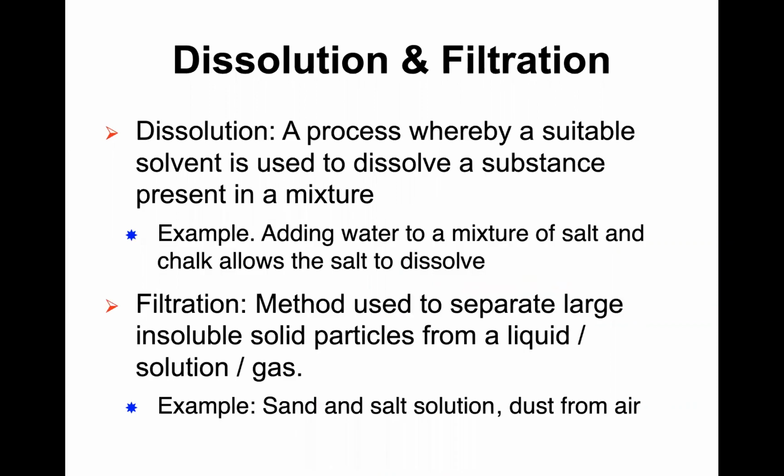Now let's look at dissolution and filtration. Dissolution, you can look at it here. We see the word solution. Solution means you will form a homogeneous mixture, right? So dissolution is a process where you use a suitable solvent to dissolve substances from the mixture. That means if you have a mixture, some of the components are very soluble in one type of solvent, but the others are not. In this case, you can use dissolution to separate them.